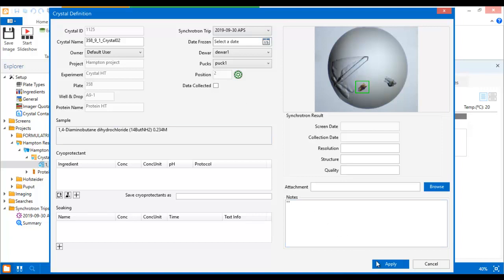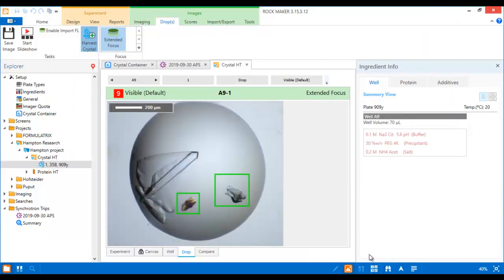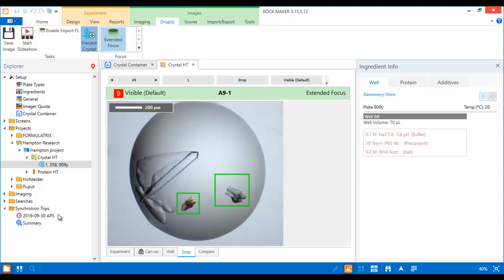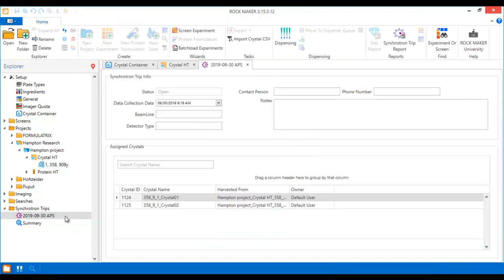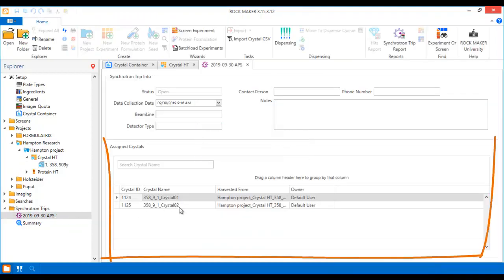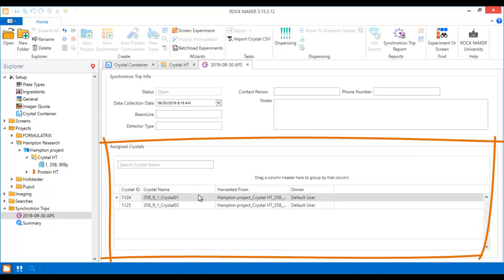So there you have it! Crystal harvesting in RockMaker is that simple. And that's all you need for your synchrotron trip. You can review your harvested crystals in the Assign Crystals panel that appears when you open your synchrotron trip.